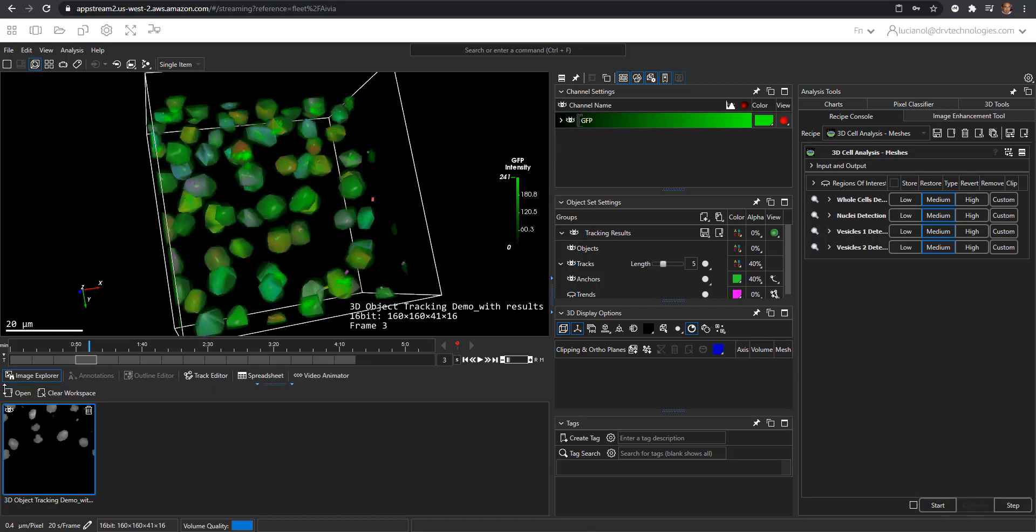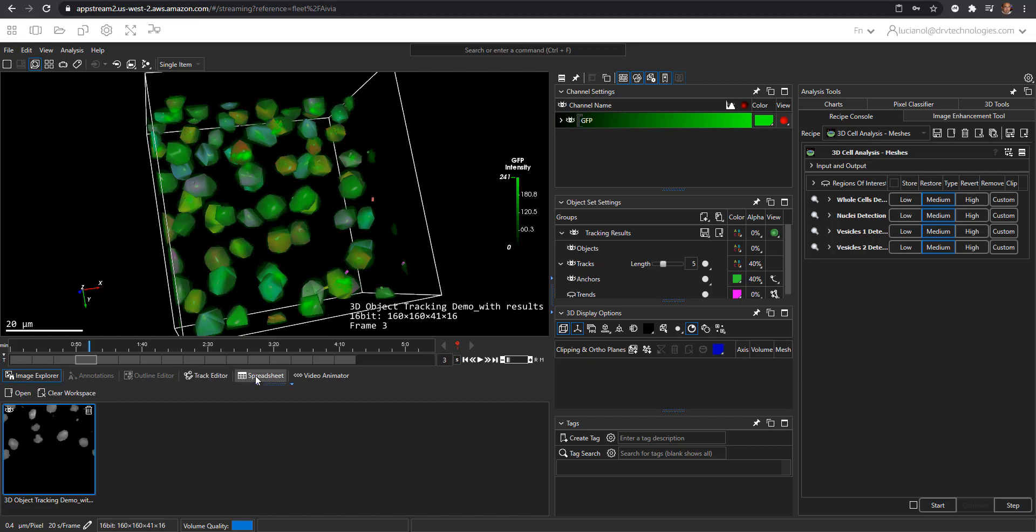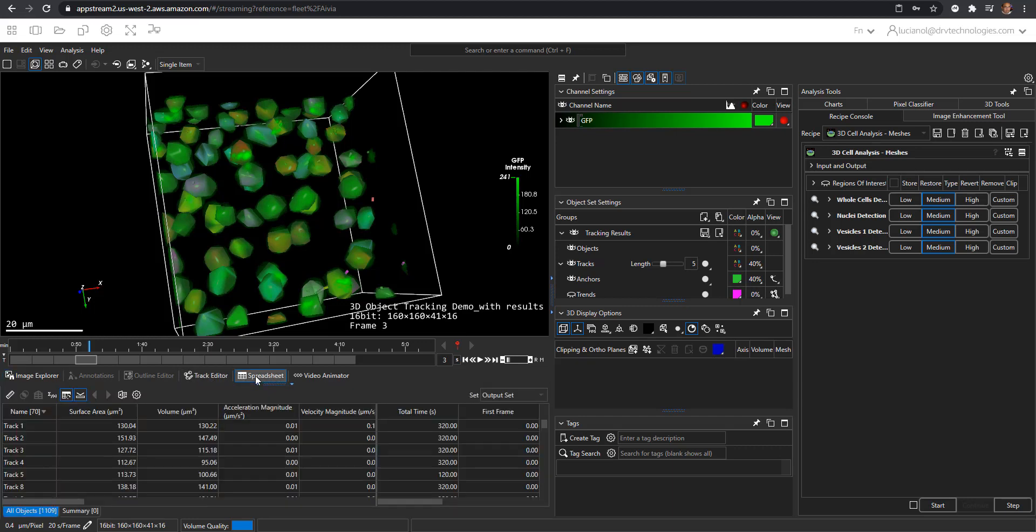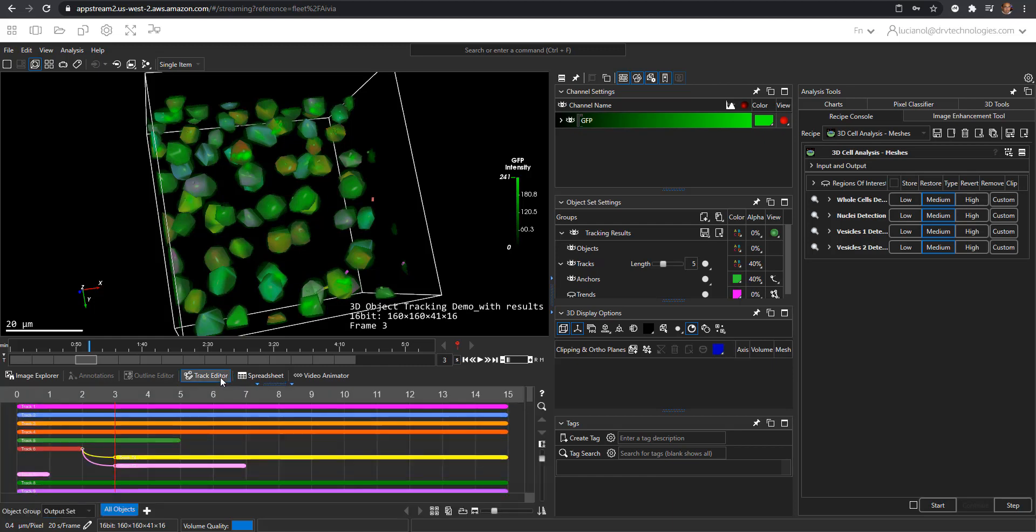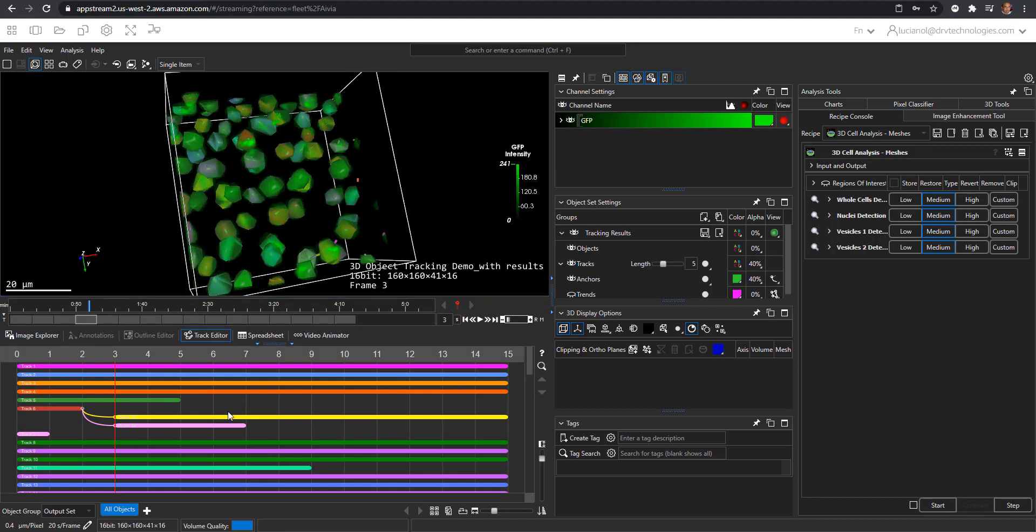The bottom panel you can close or you can use it to look at the results here, or look at the track editor and interact with the track editor here.